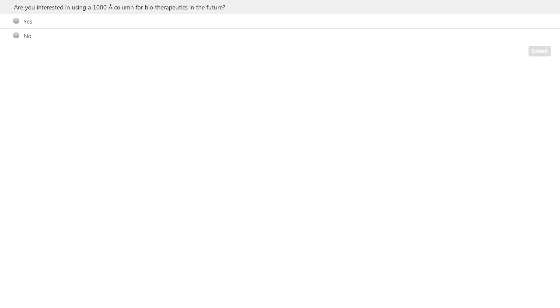So it's definitely sticking to the column. Where is it and how is it interacting? It's difficult to say, but due to the nature of the separation, it is most certainly being stuck to the column and may not come off at all.